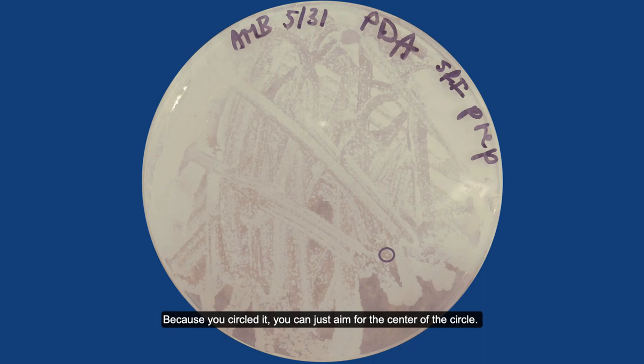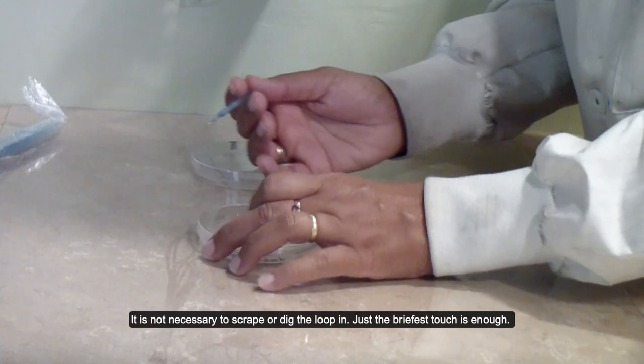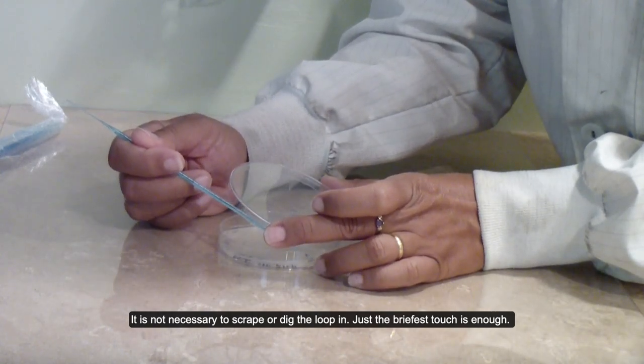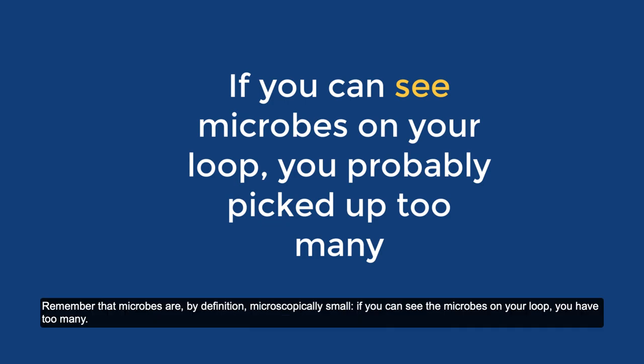Because you circled it, you can just aim for the center of the circle. It is not necessary to scrape or dig the loop in. Just the briefest touch is enough. Remember that microbes are, by definition, microscopically small. If you can see the microbes on your loop, you have too many.